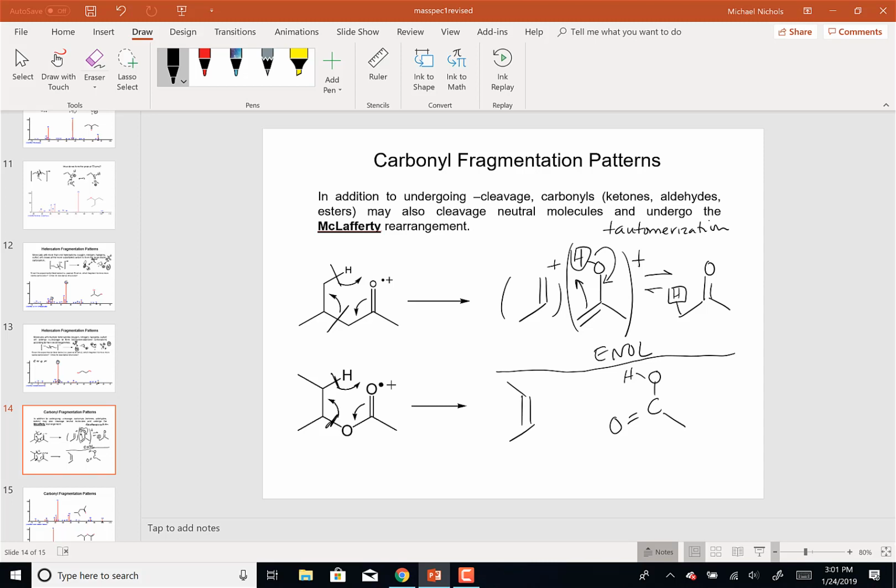And it's not enough when they're doing drug testing to find the metabolite by saying, oh, that metabolite will come off the GC or the liquid chromatography instrument at 10 minutes and it has this mass spectrum. That's not enough. They can't convict you, they can't take away your gold medal based on just that.